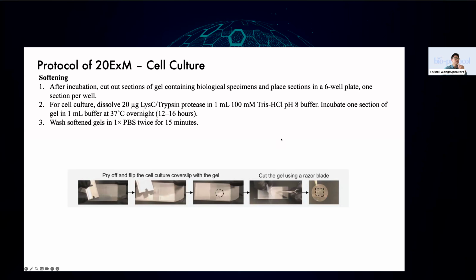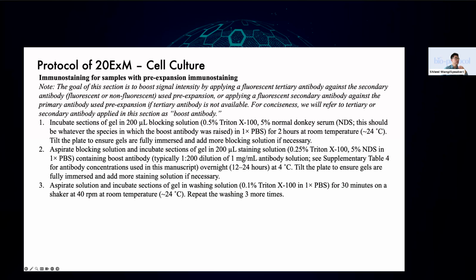After cutting, I just put it in a 6-well plate and add Lys-C or trypsin protease and let it incubate at 37°C overnight. After the 37°C incubation, you can wash with PBS 2 times for 15 minutes to remove the protease.